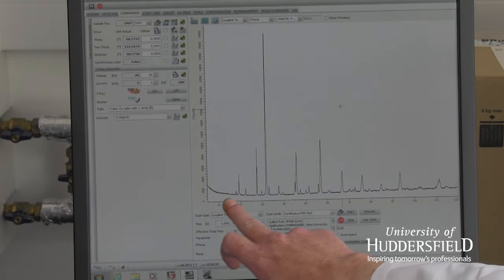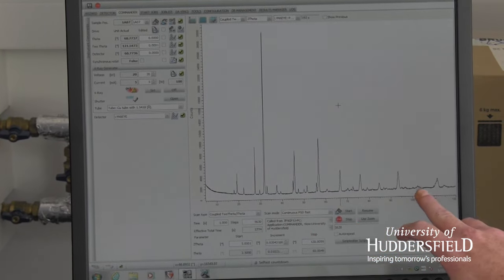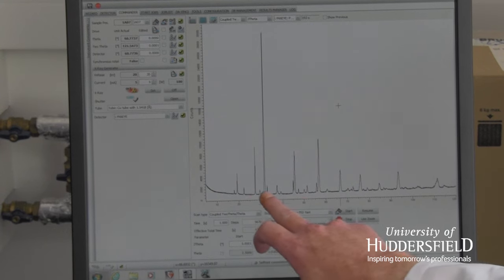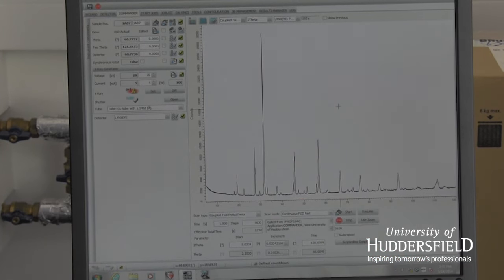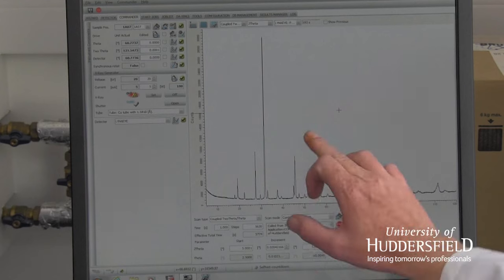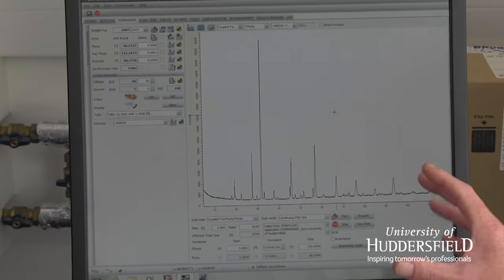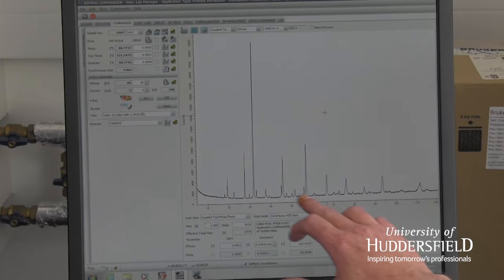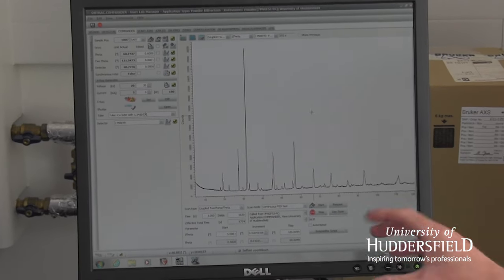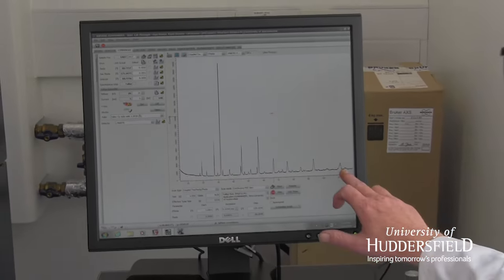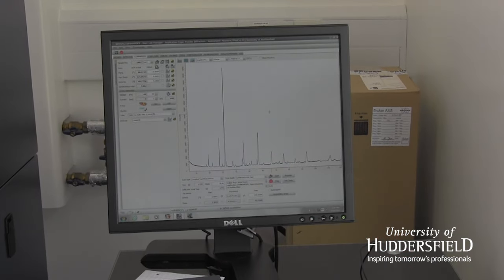This is the diffraction pattern that we get from that sample that I've just shown you. You've got peaks of different size in different spaces apart. The spacing and the size of the peaks is all fundamental to its molecular structure. You can work out from these where the atoms are arranged, in what position, in what order, just by analyzing all that data.